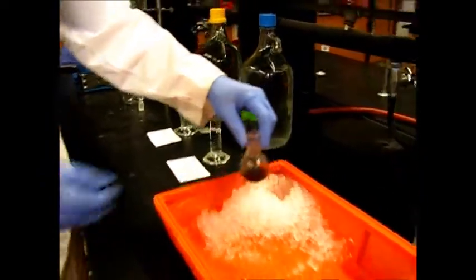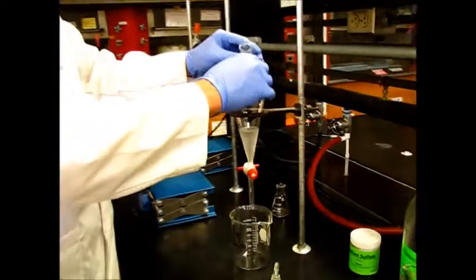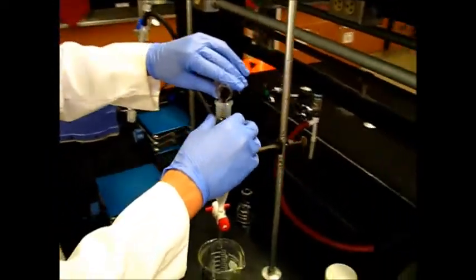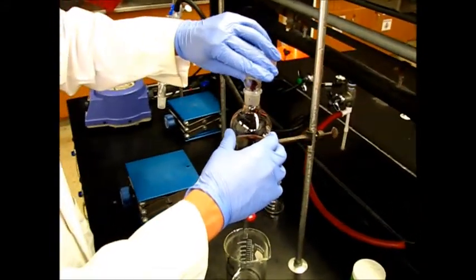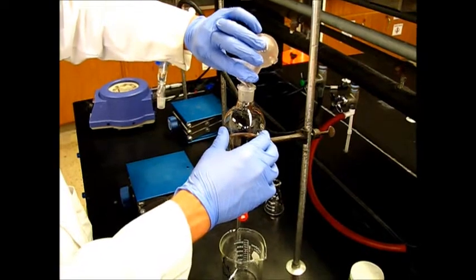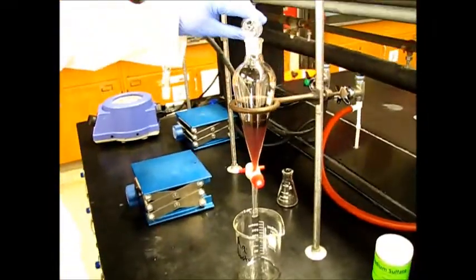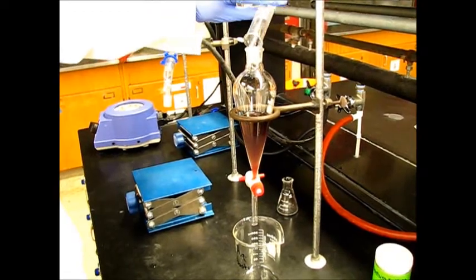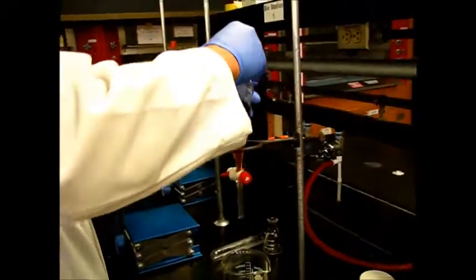So it's been sitting in the ice for about 10 minutes now. It's nice and cold, so we'll go ahead and do this wash. Pour it in with our cold water. Follow it up with the rest of our cold water. So we're going to shake this a few times just to get everything nice and mixed.